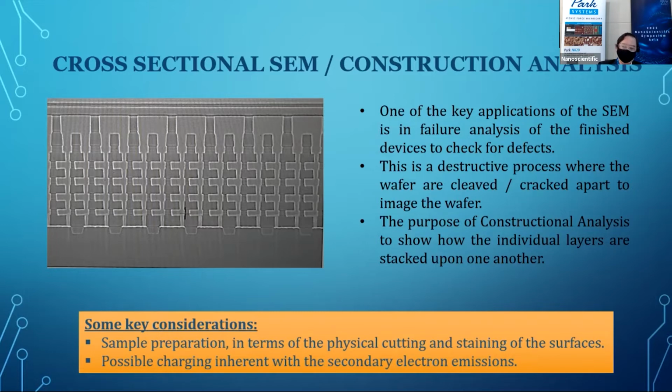However, having said that, the concern we have is that, again, you need a significant amount of sample preparation before you can stick it into the SEM. You have to cut it, cleave it, polish it, and stain it before all these various structures would be found. The other concern that you would encounter is the fact that there would be some level of charging. So a lot of background characterization has to be performed on the tool to minimize this charging on the surface. Because once the surface is charged, instead of getting a nice image, you end up with a very black image.